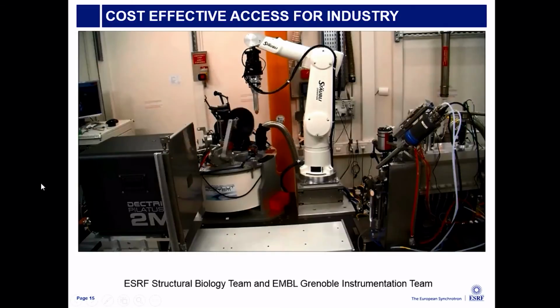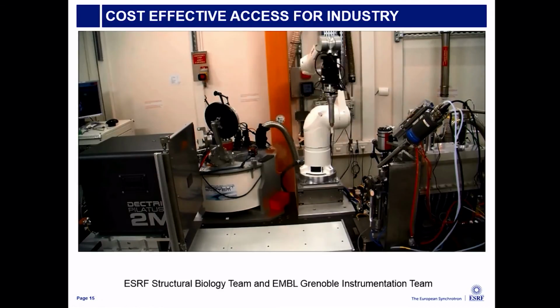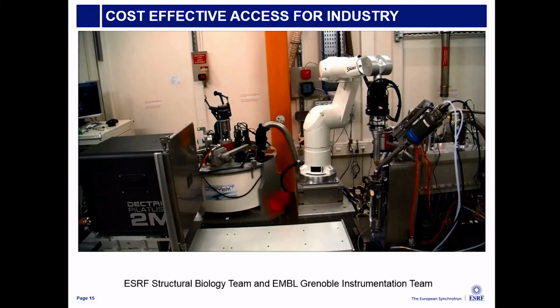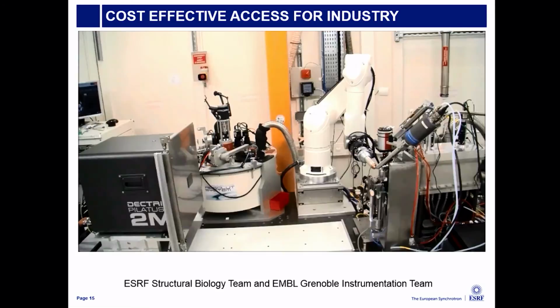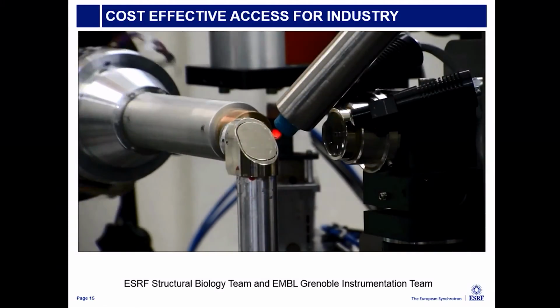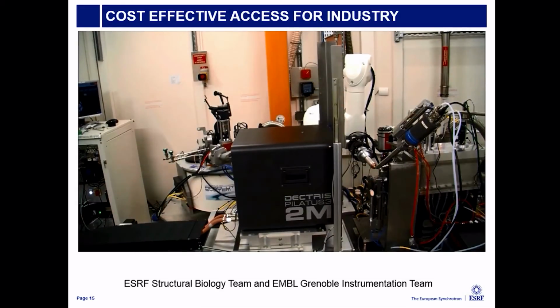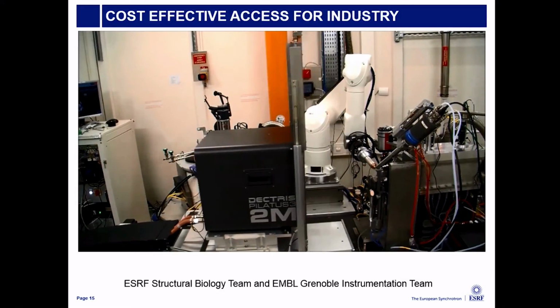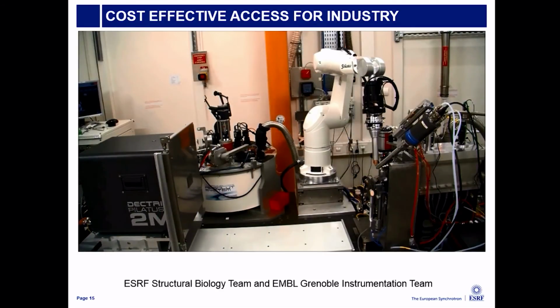So this has been an evolution of the structural biology beamlines over, Gordon, where is he? Gordon over there. Last 20 years or so, building up to a system that is now fully automated. The samples arrive from academia and industry. They're put into the robots. The sample changer puts it onto the beamline, calculates the data collection strategy, processes the data, can even try and solve your structure, I think, and it just chugs away routinely, the same thing day in, day out.